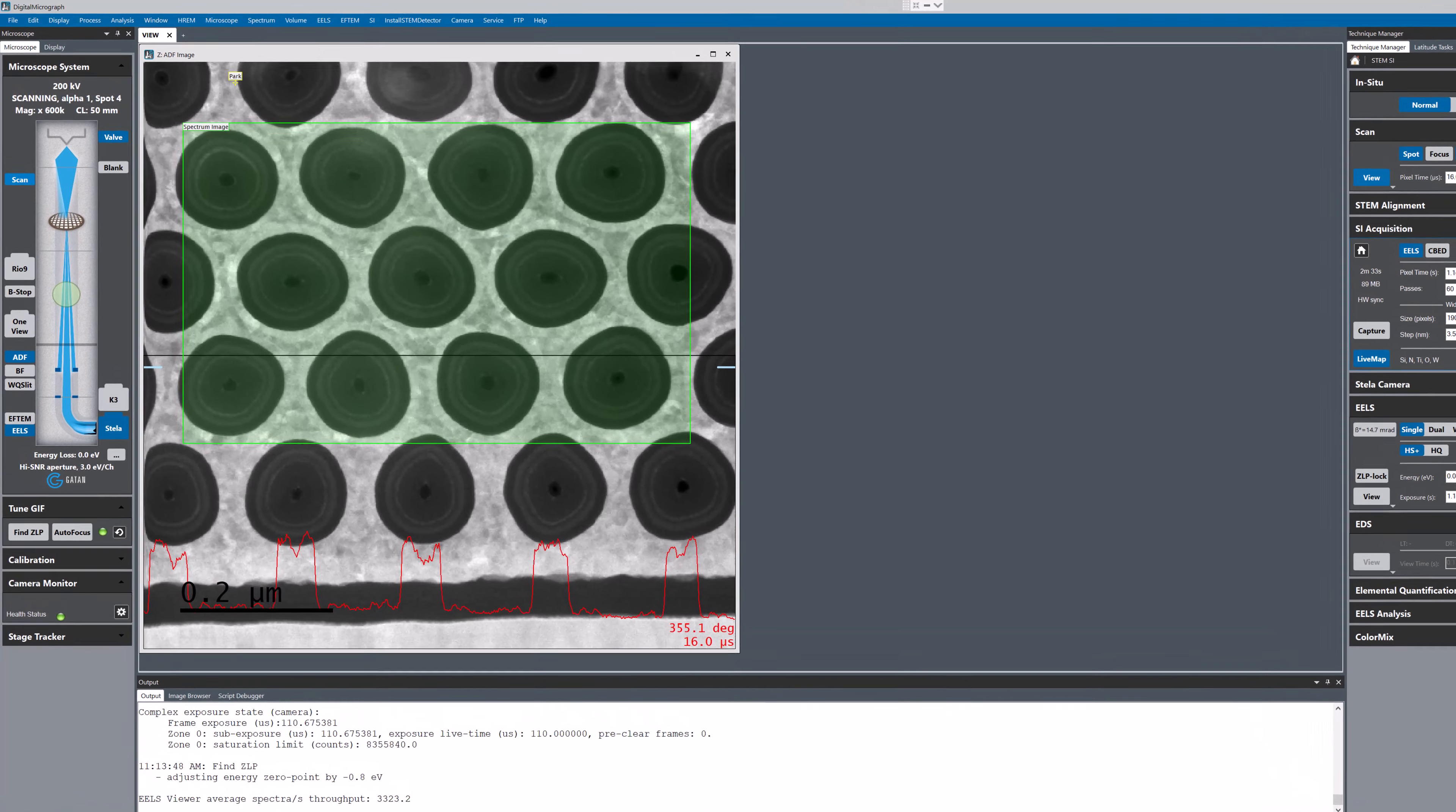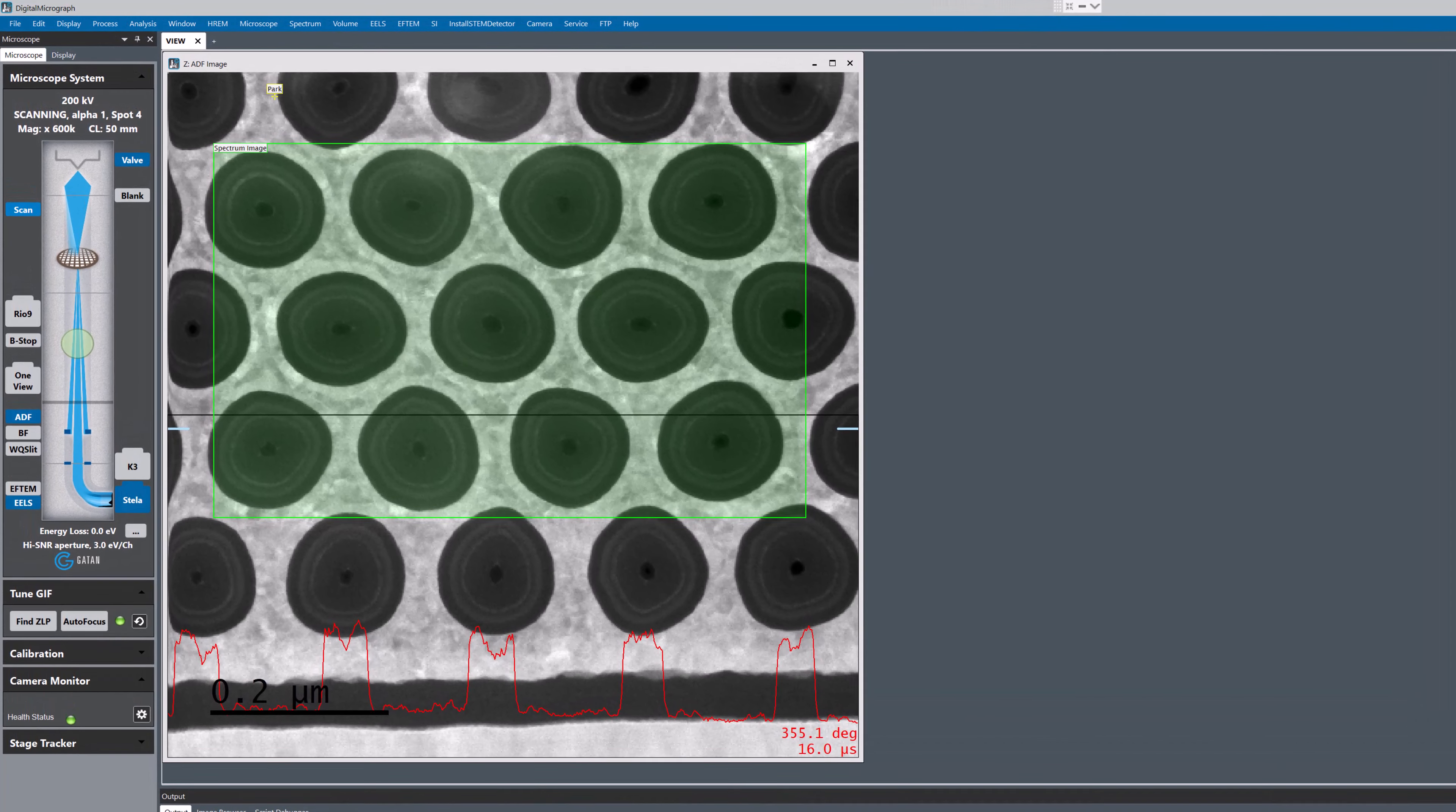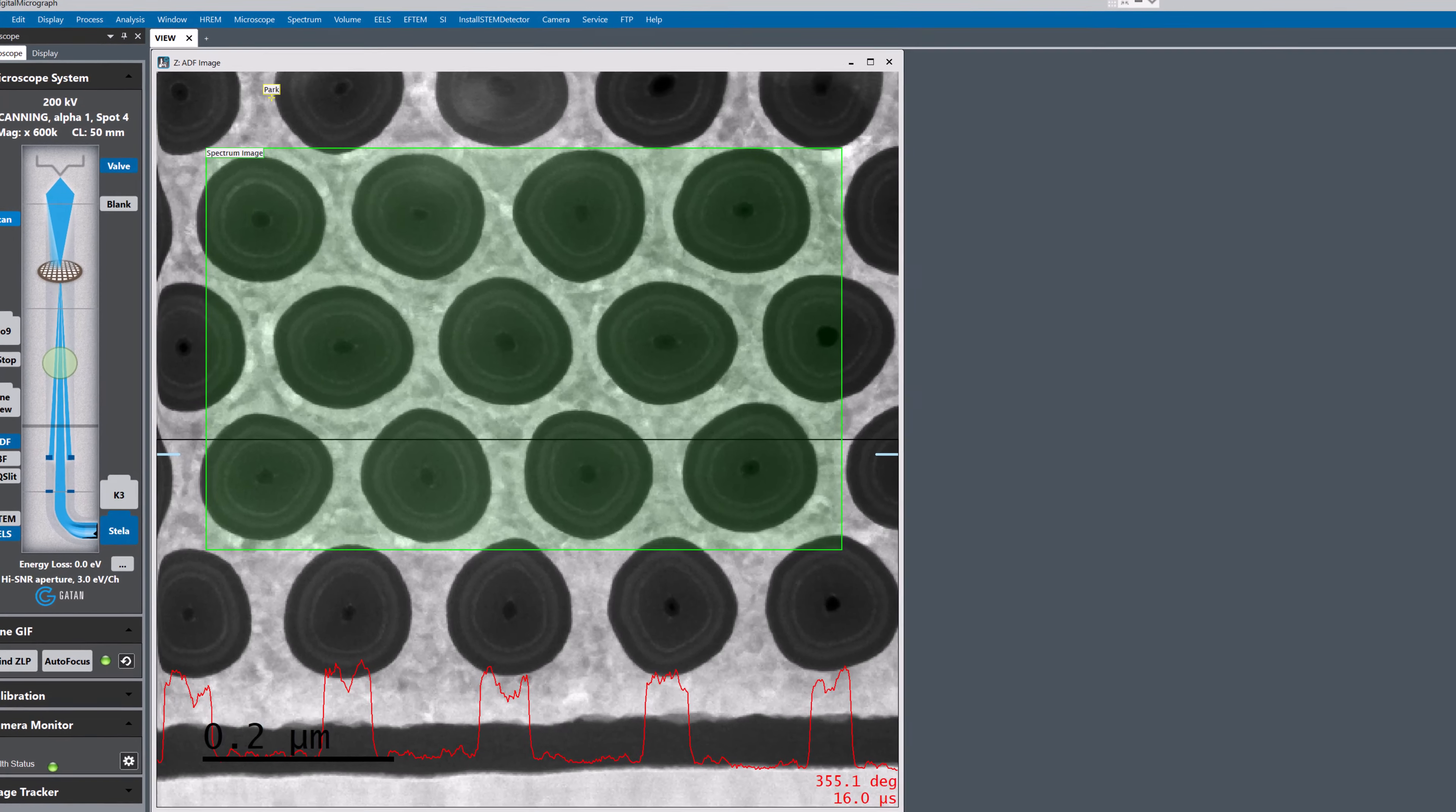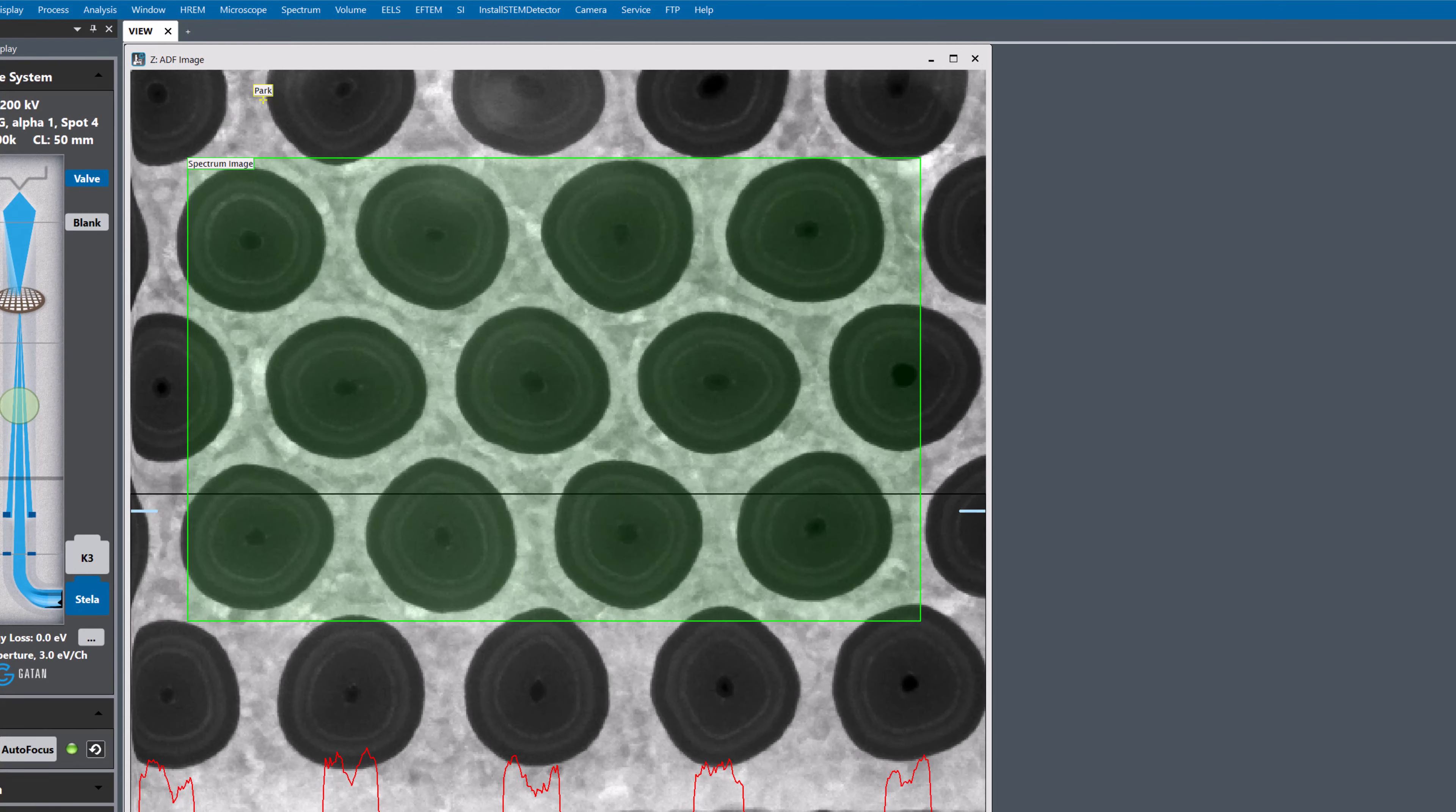As you can see from the microscope user interface in Digital Micrograph, we have a fully loaded system. I'm going to acquire EELS data from this area of a 3D NAND specimen at 9000 spectra per second using the Stellar camera.